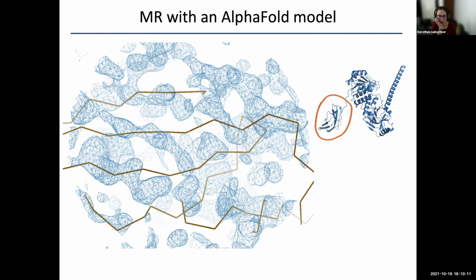Okay, so one answer, for example, was the lines don't seem to match the density peaks, right? For example, here it's kind of in density, but here it's just traversing these blobs, and there doesn't seem to be any density in between. So it looks like we didn't really catch the orientation of this domain here. And well, this structure has been determined, so we know the answer.